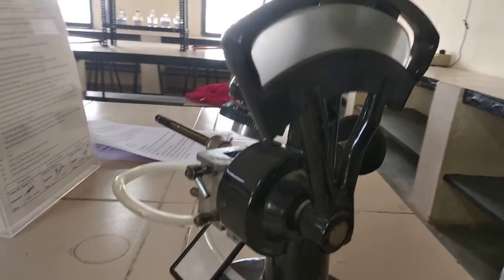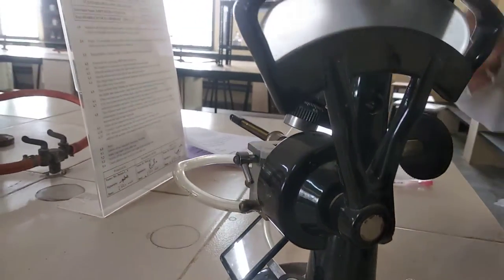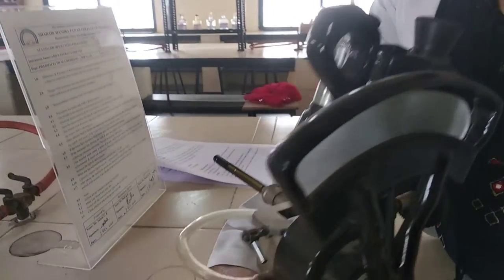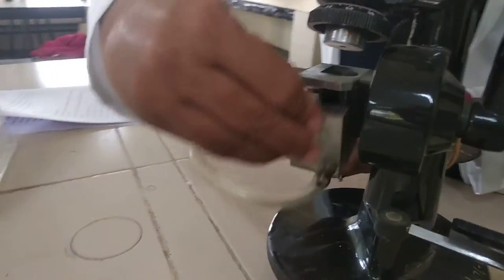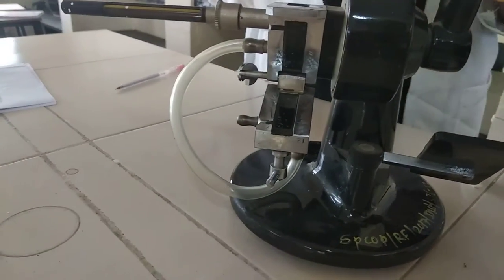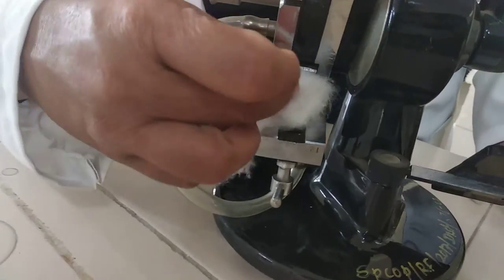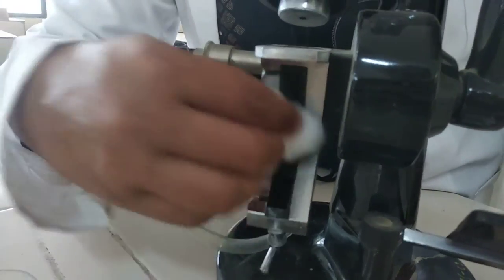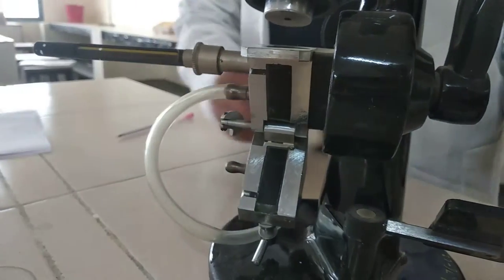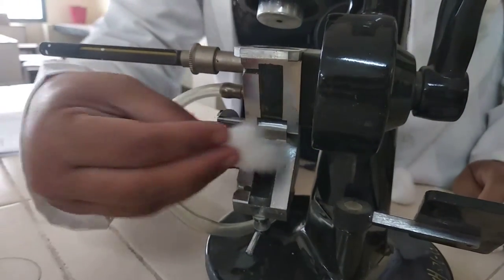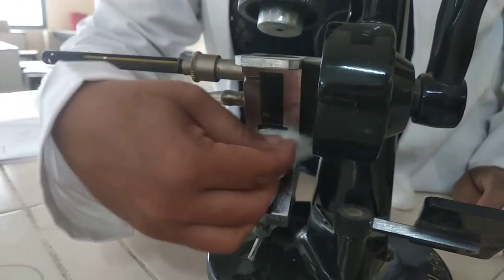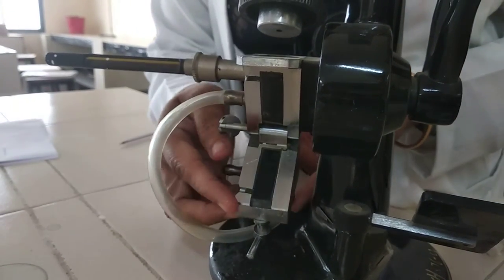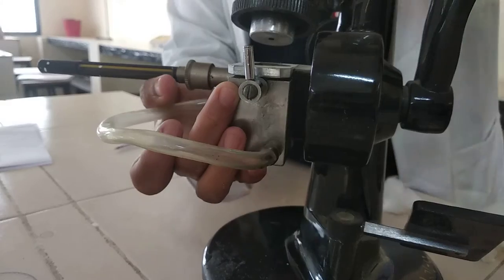After taking the reading, the prisms are cleaned. Afterwards, whenever your reading is finalized, again you have to clean this prism, both sides, because for next preparation we have to keep it clean. We have to again clean it with acetone solution and then dry it and close the prism.